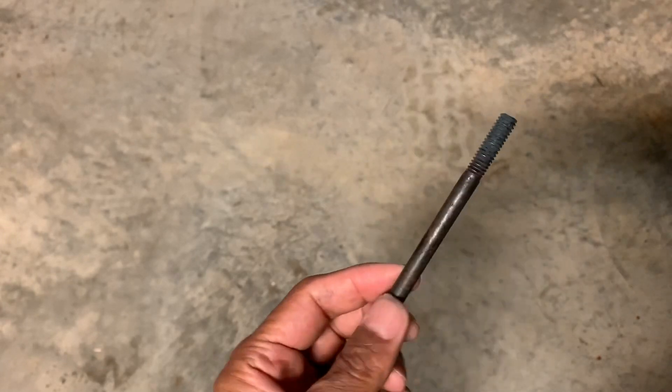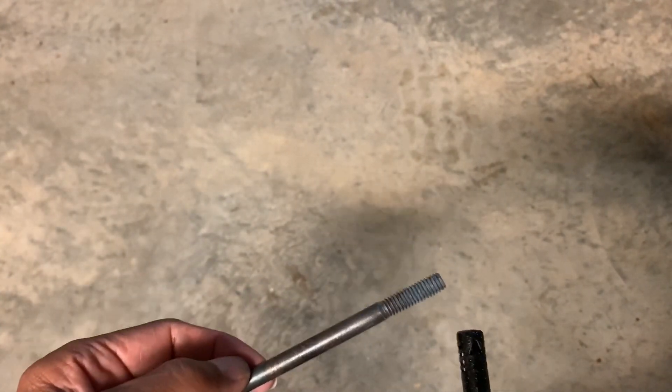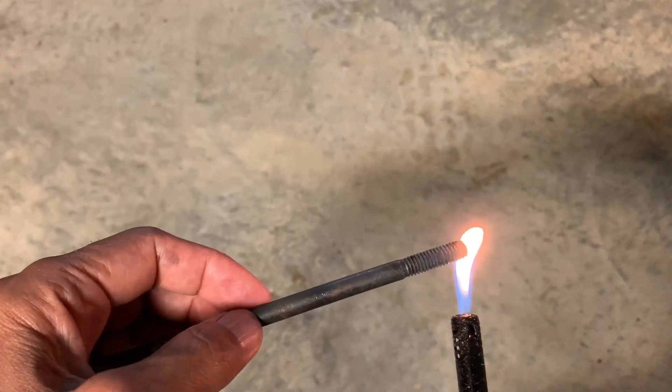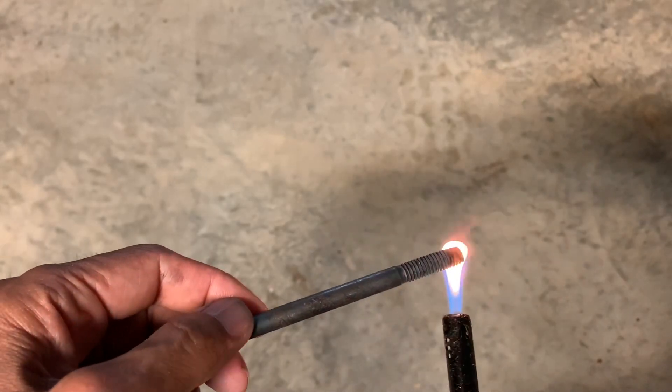So here we have a piece of iron and let's see if it will burn. Obviously it's not going to burn but let's try it just to show a point. It does nothing, just gets hot.